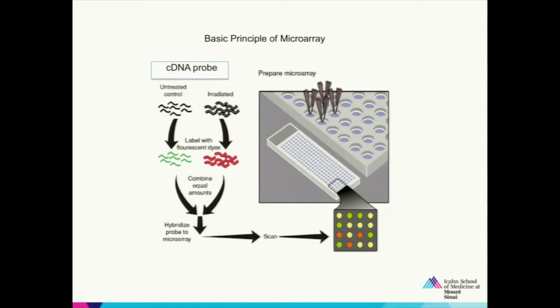So this is the basic fundamental thing. You have the DNA on the microarray, you have the test DNA, just hybridize it and try to understand. With only this simple concept, we can do many, many things. One just has to think about what we can do with this hybridization technique. Okay? We'll go through what we can do. So we can do many things, that's why I told you, right?